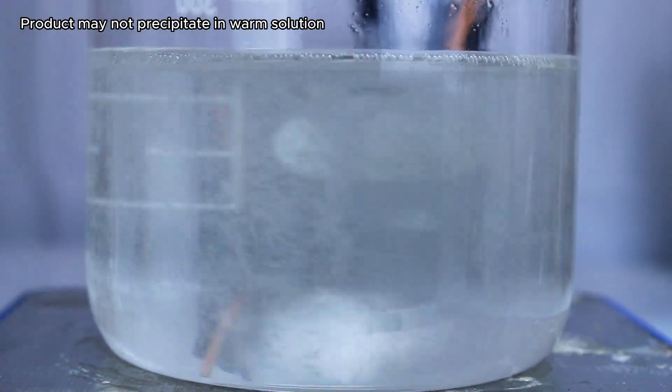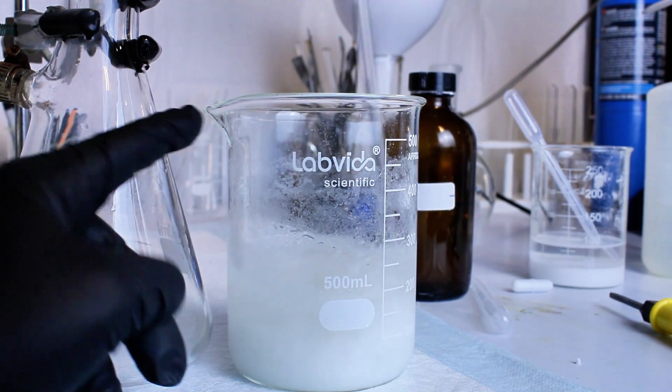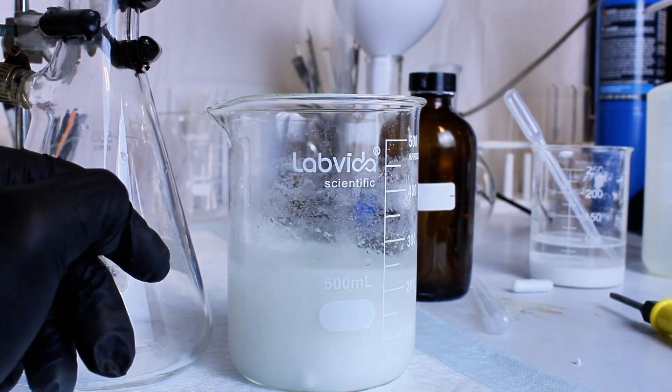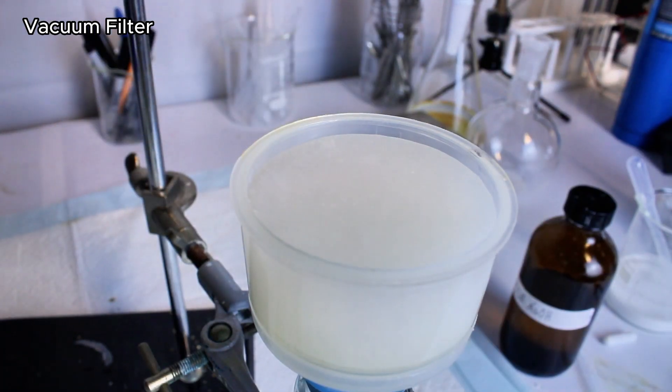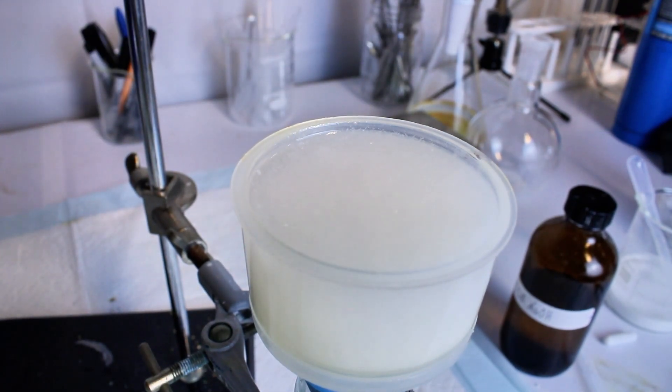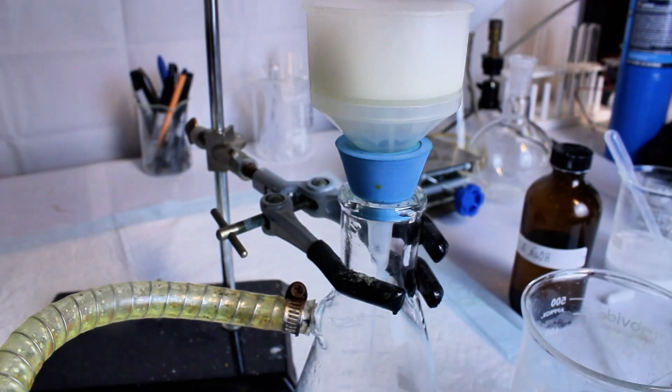In any case, after the beaker has cooled down and my benzocaine precipitates, I now need to filter it off, and I'm going to do this by vacuum filtration. This can also be done with a simple coffee filter, but the vacuum filter is a lot faster and since I have it, I might as well use it. Once the product is done filtering, I want to rinse it thoroughly with ice cold water to get rid of any residual sodium sulfate or unreacted reagents.